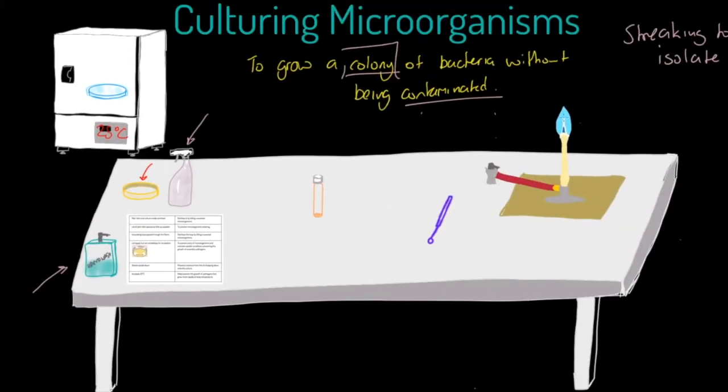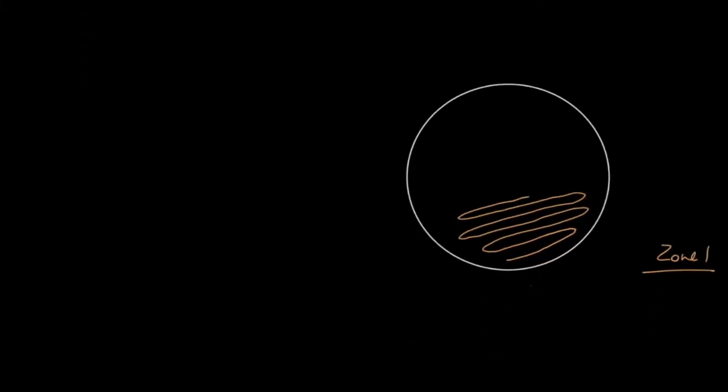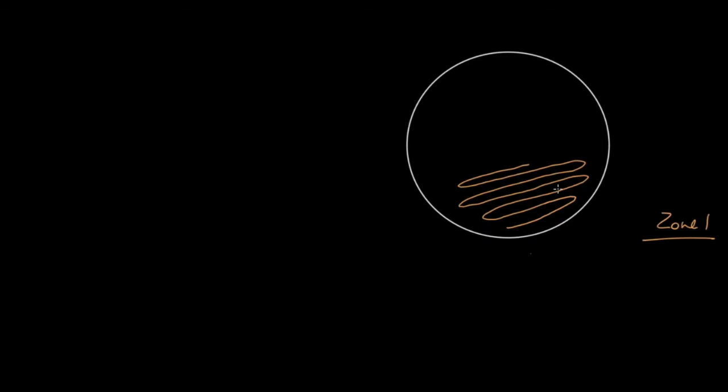So there is zone one. Now we take our inoculating loop and put it back through the flame to sterilize it again. You might expect us to go back into the bacterial culture — but no, we sterilize and go straight back to the petri dish. At this point there are no bacteria on the end of the loop.